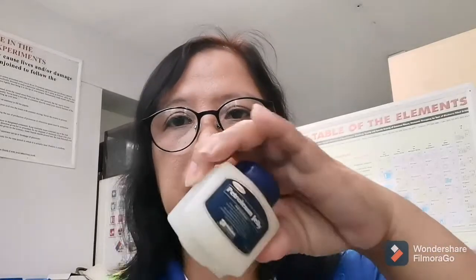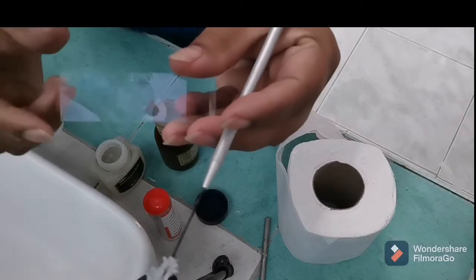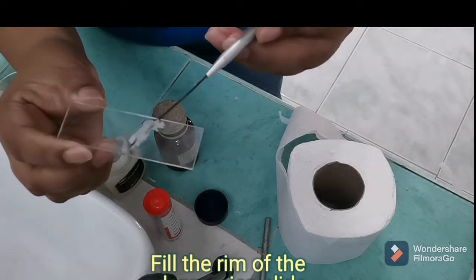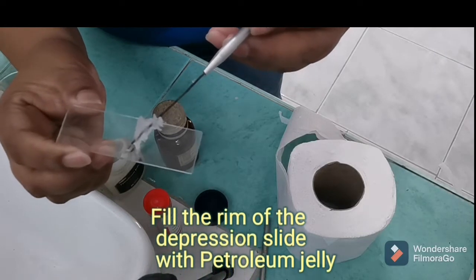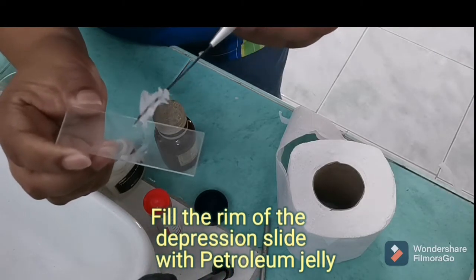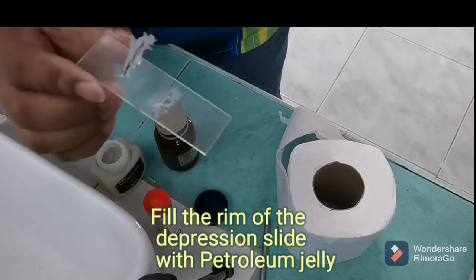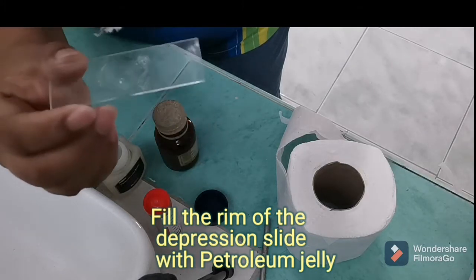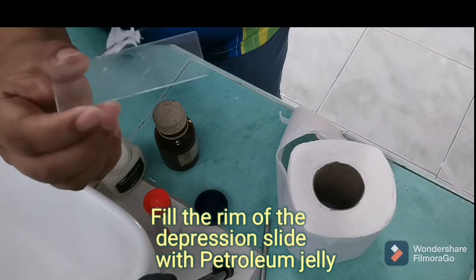So again, I will be bringing out our petroleum jelly and applying it around the rim of the depression. So at this instance, I will be placing some of the petroleum jelly just around the depression area of the depression slide.